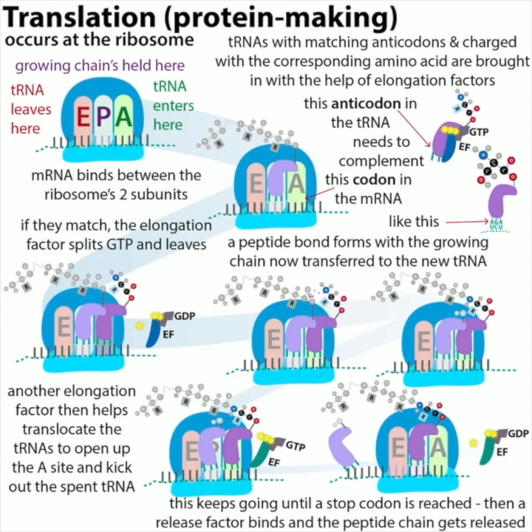Another thing you can do is actually change the sequence of your protein without actually changing the protein. It's something called codon optimization. So the basics of translation, the process of protein making, is that the genetic instructions for the protein are written in mRNA. Three RNA letters, which we call a codon, spell one amino acid.